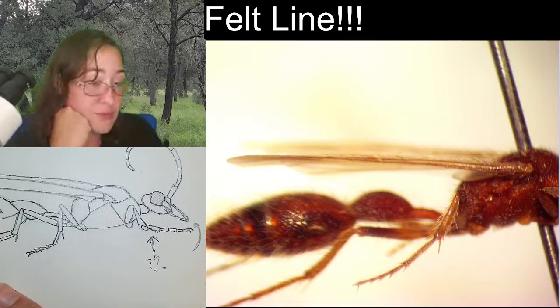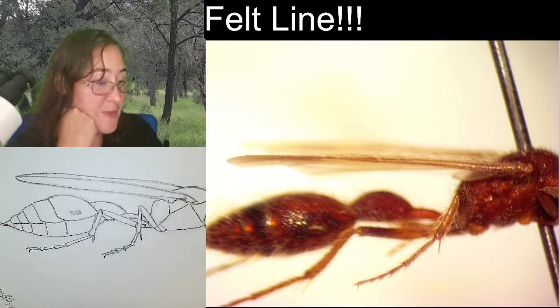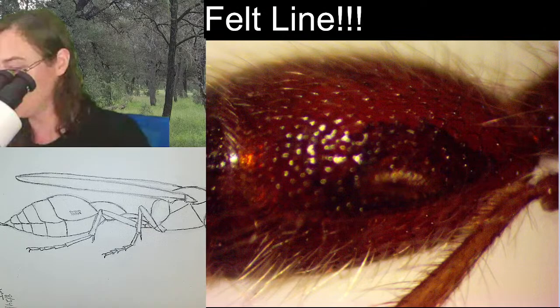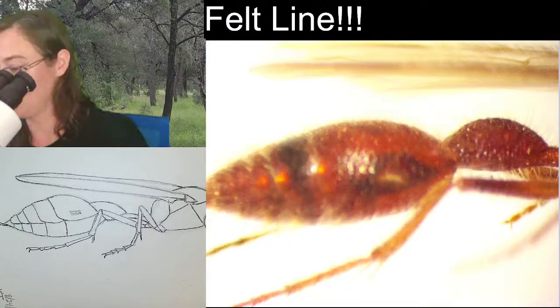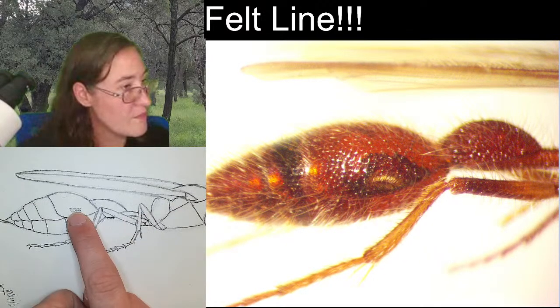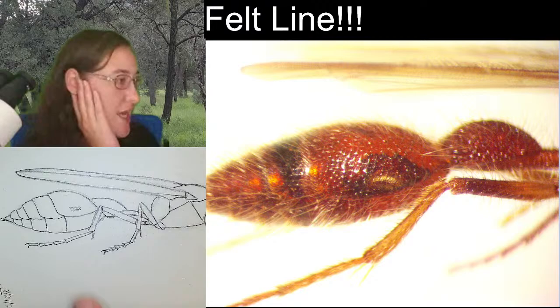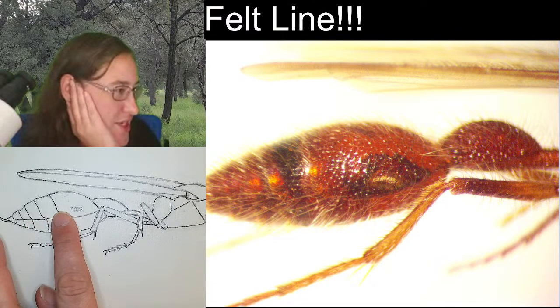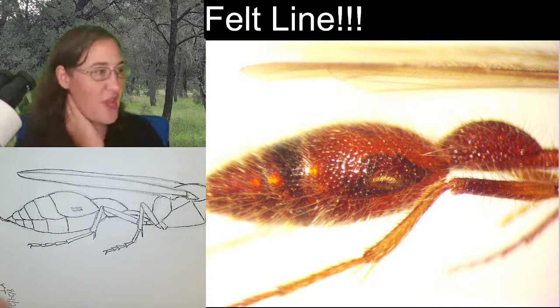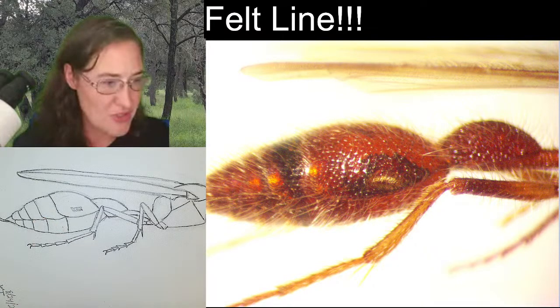What is the importance of the dark spot on this one right here? That is the felt line. That right there is the felt line. We're not exactly sure what it does, but it helps you know the other spot. You're right. All the most stylish insects are wearing them this season. The other spot. Let's go look for the other spot.